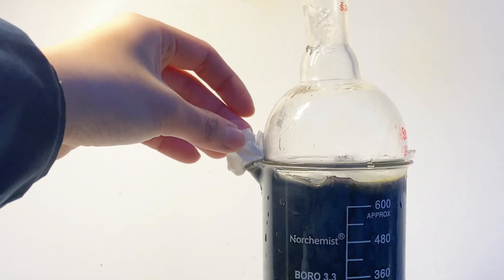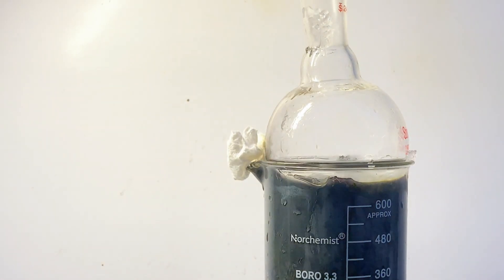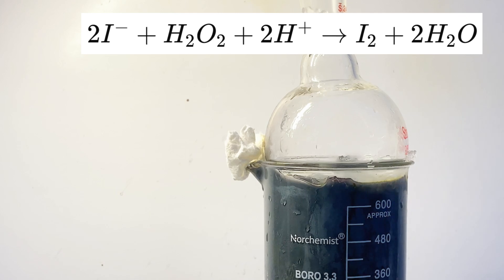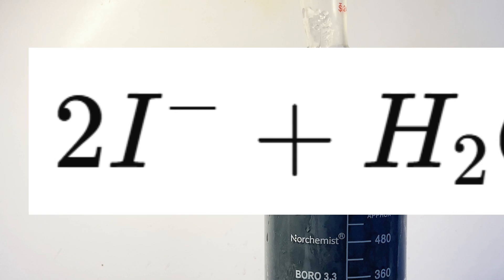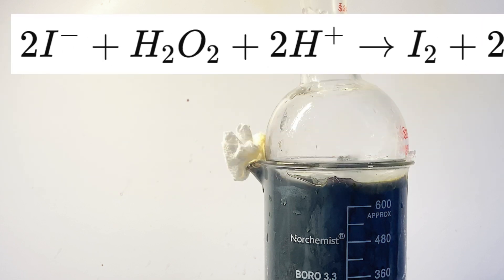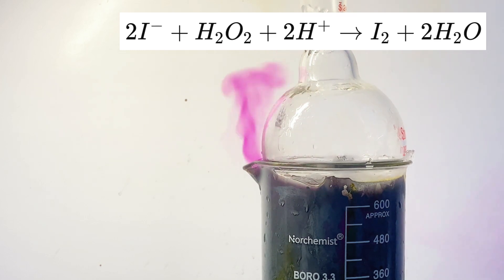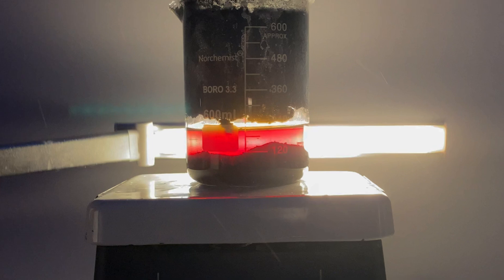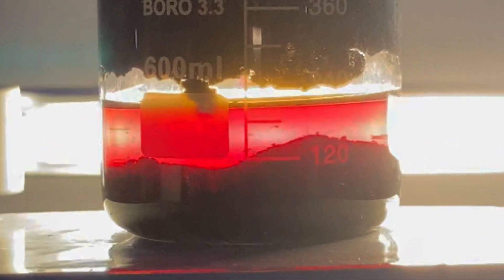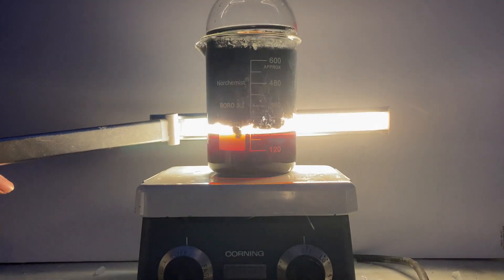Now theoretically, any acid could work for this reaction as long as it provides H+ ions, as it is a key part of the reaction. I chose to use hydrochloric, but evidence has shown that this could produce small amounts of chlorine gas. Anyways, I'm outside so I'm going to be fine. The way this reaction works is that the iodide from the potassium iodide gets oxidized into elemental iodine, and the hydrogen peroxide and acid are used to help with this. The potassium and chloride ions that come along are omitted in the equation as they are spectator ions.